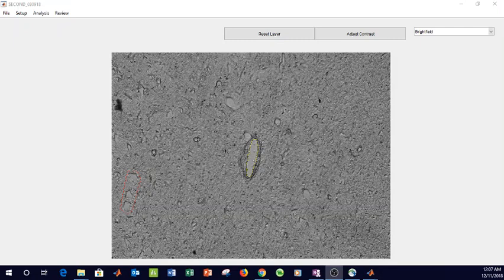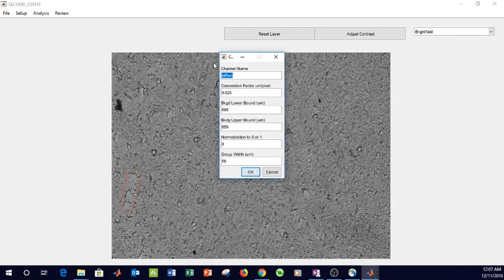All right, so in this video we're going to talk about compiling our intensity data. Imagine you have hundreds and hundreds of files, each with these raw intensity measurements, and we now want to bring all of them together in, say, an Excel file. So we've built this function under review, compile results set.